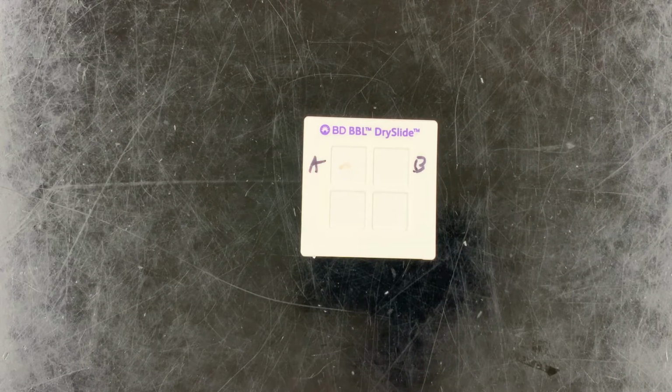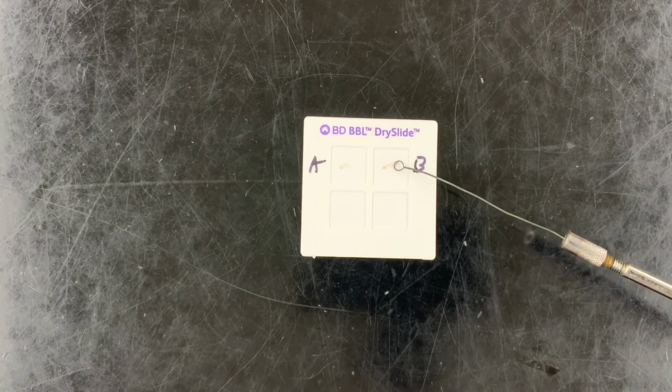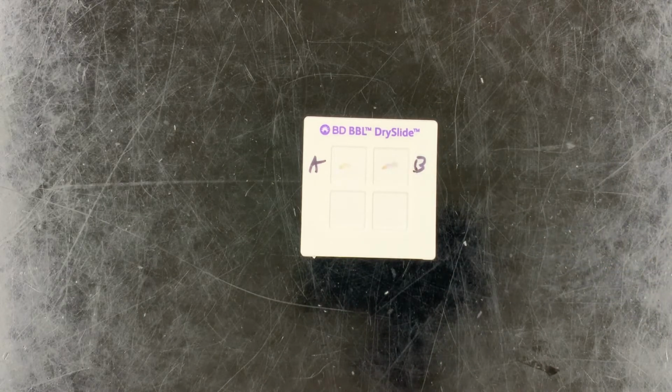And now I'm going to take my bacterium B. Usually I take not a super large amount, but a kind of healthy amount. And then I'm going to place that on there. And now we're going to wait. All right, and the reaction takes anywhere from, well, actually it's happening very fast. You can already start to see, right? But it can take as long as about 30 seconds, depending on how much bacteria you put on there, how fresh they are, et cetera.